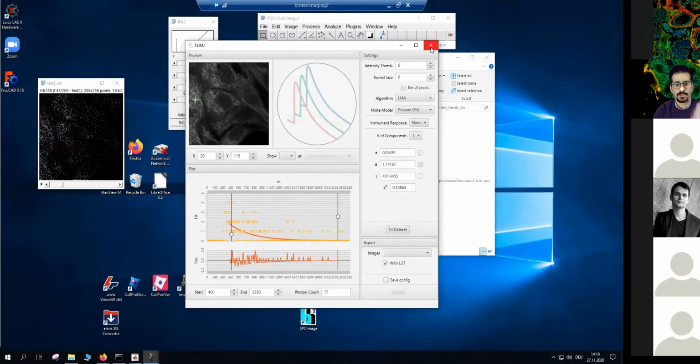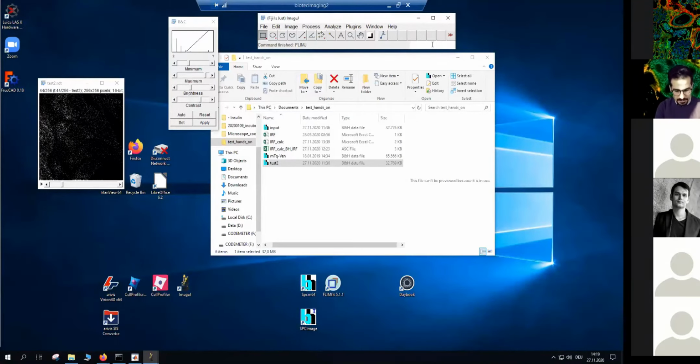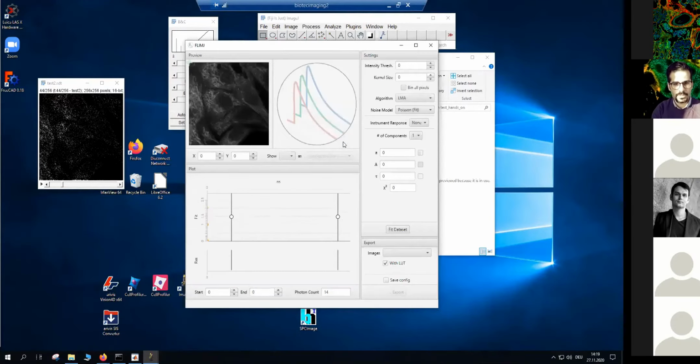And that's why I just closed it again. Maybe there is something between point and comma. 0.05. Maybe that's why I was using so many digits. No, still. What can I do? Does anybody have any suggestion? Just one, no suggestion, but what I noticed is that when you entered the 12.5, it was automatically jumping back to 10 and not really keeping the 12.5. So I don't know what that means.